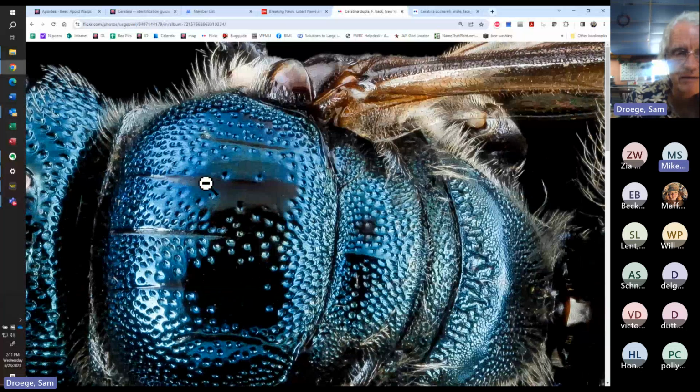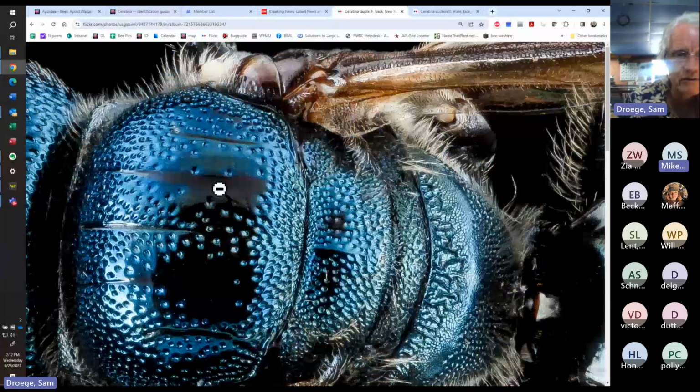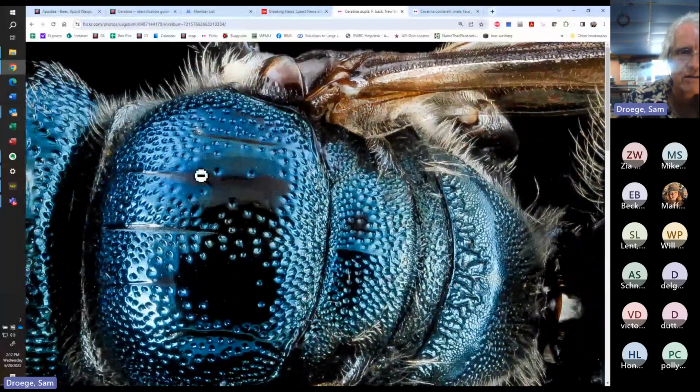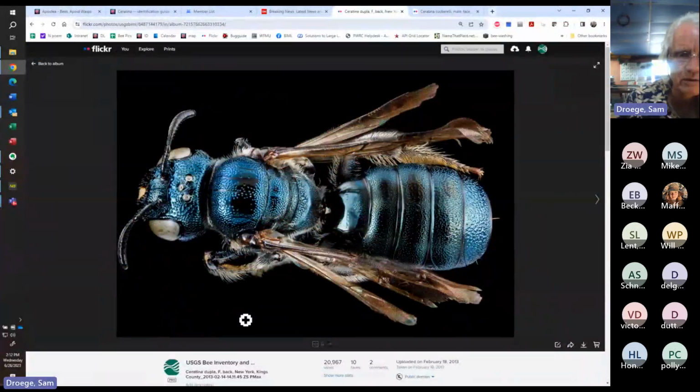Okay, well, that could be a good character then, because see here in this calcarata or mikmaqi or whatever it is, there's no hint of that line in there. Or is this dupla? This might be the dupla one, or supposed dupla.